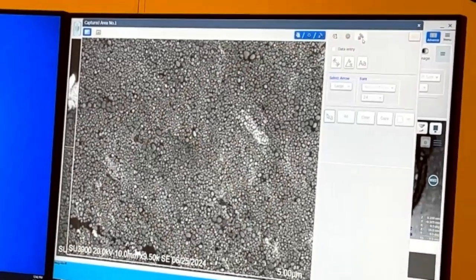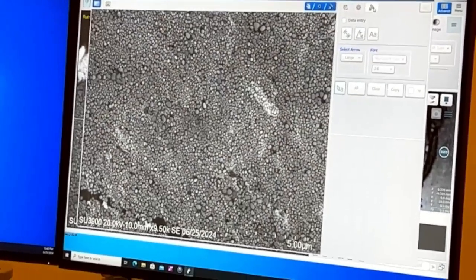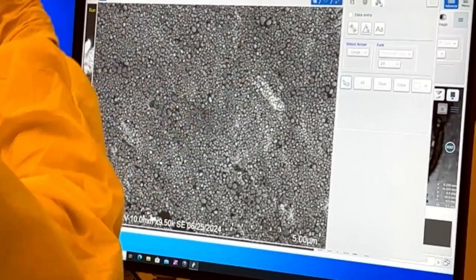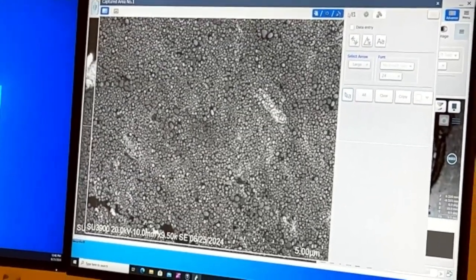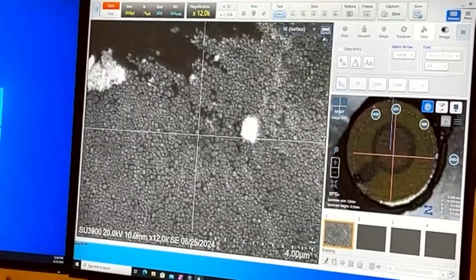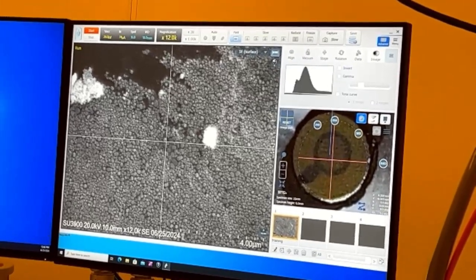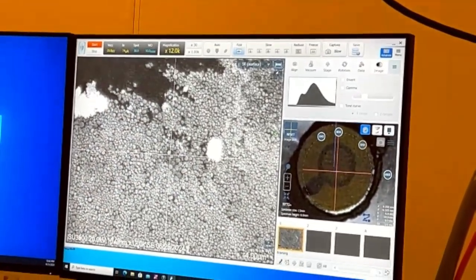A different part. Yes. So I have a data entry here as well. And you can do an auto, you can change contrast here after the fact, whatever, right? So yeah, you have lots of options of how you want to do it. This just shows a histogram of the live image right now.